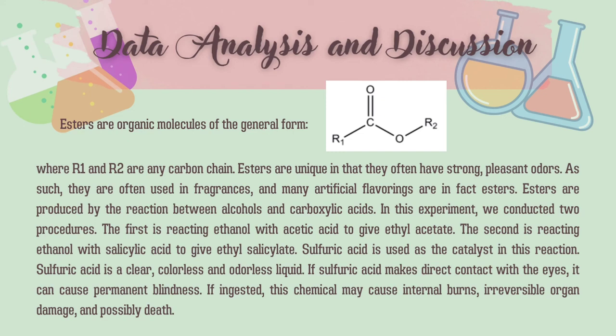And in this experiment, we conducted 2 procedures. The first is reacting ethanol with acetic acid to give ethyl acetate, and the second is reacting ethanol with salicylic acid to give ethyl salicylate. Sulfuric acid is used as the catalyst in this reaction.